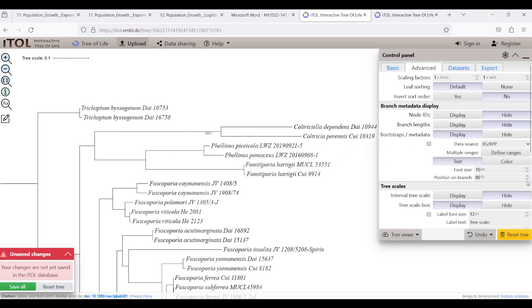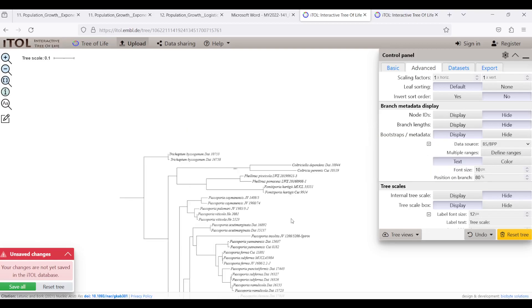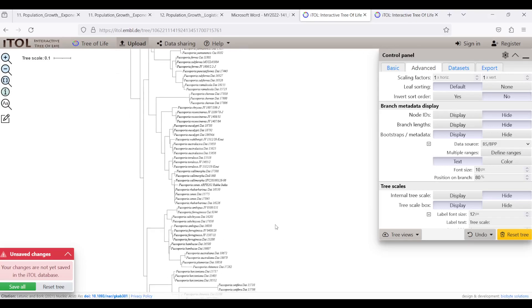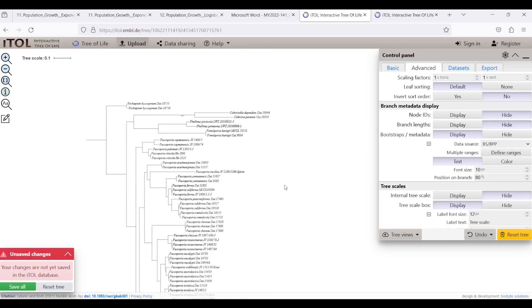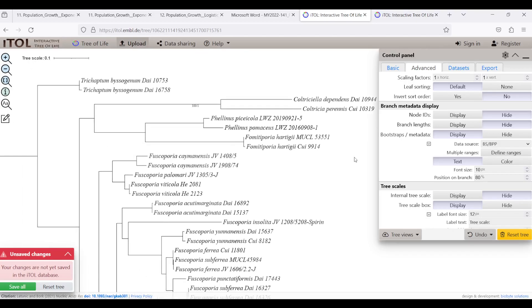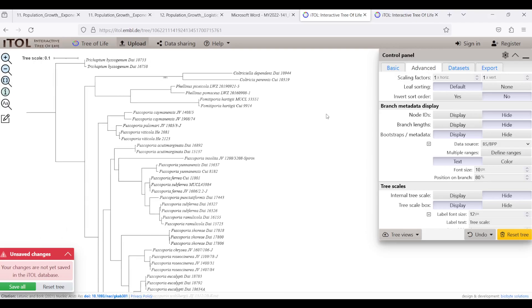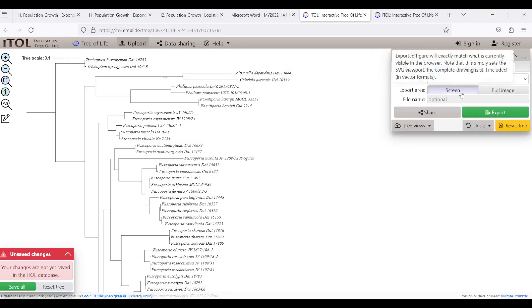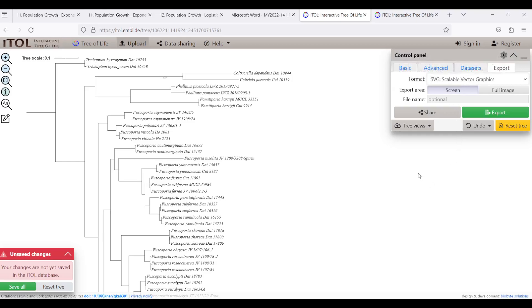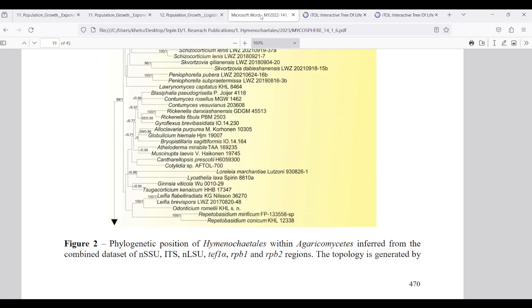You have to select the BS/PP field to display it, and you can see that the combined value is now shown in the tree. You need to repeat this process for all nodes in the tree — it will take a little time — but once done, you can export your data in whatever format you want.